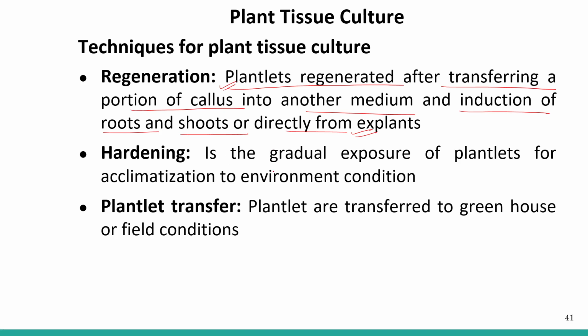Hardening is the gradual exposure of the plantlets for acclimatization to the environmental conditions. When the plantlet is exposed to the natural environmental condition, we should take care that it gets acclimatized in that particular condition. This is called hardening. Plantlet transfer: the transfer of the plantlet to the greenhouse or the field condition. This is called plantlet transfer.